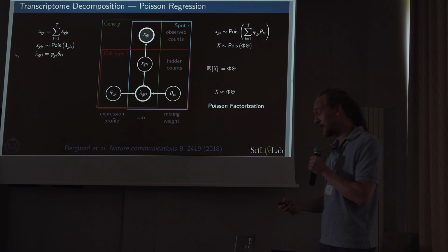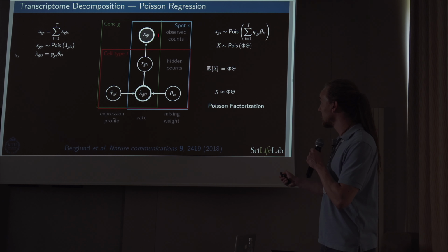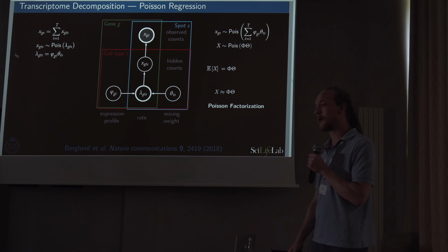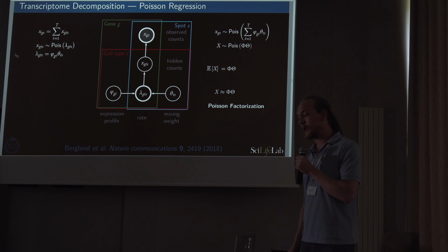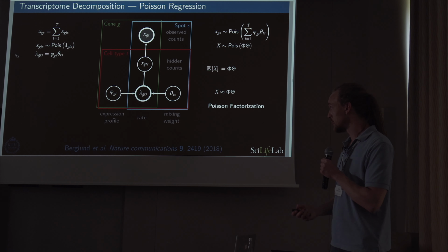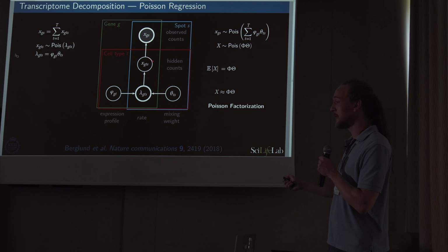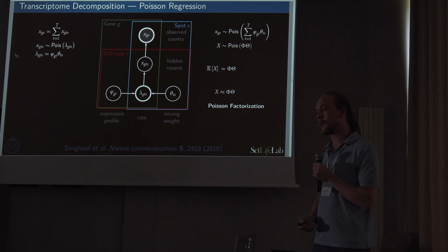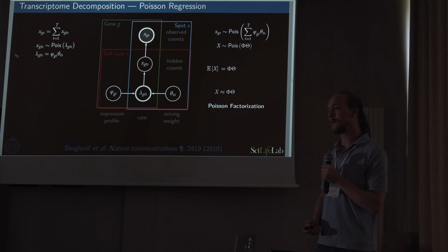I would say that what we're modeling here is really only the number of counts that we actually end up seeing on the array. And as for how much of this type and how much of that, sure, you can look at these parameters, but since we have these hidden counts here, we can do statistics on them directly. These are kind of the decomposed counts.